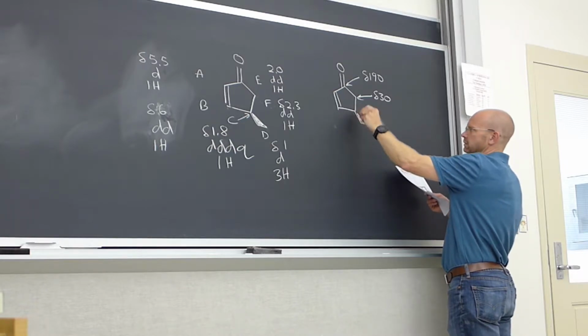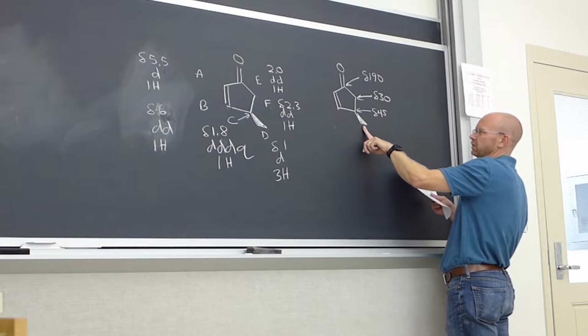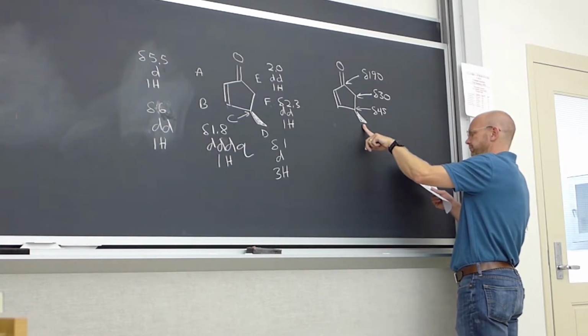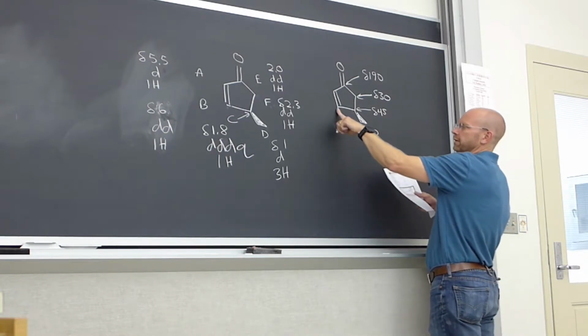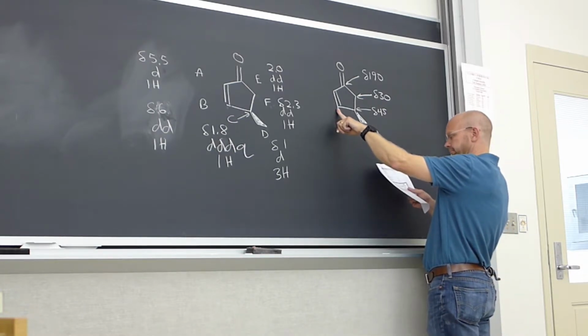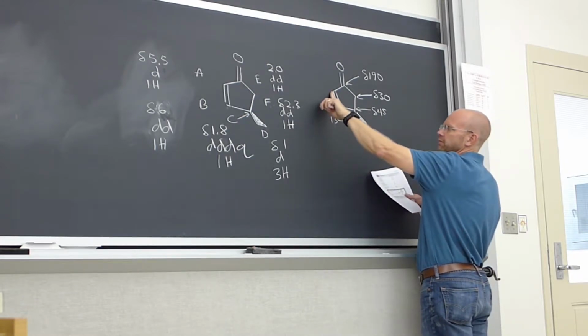Yeah, 45 would be a reasonable guess without a better table. This one, 20. What do you think? 130. 130? Sure. How about this one?